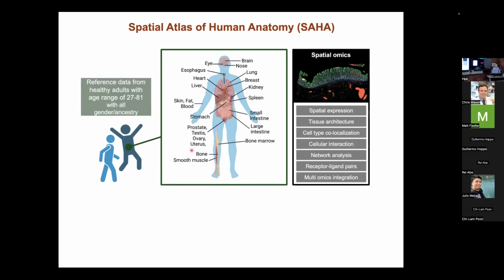Can I ask, what metric do you use to determine heterogeneity, or the extent of the heterogeneity? When you say that, you mean cellular heterogeneity? Yeah, I guess so. I think it's a fair point in the sense that, look, every cell is going to be a little different from each other. I think if you took a root mean of the various expression levels within the cells, they're extending far beyond that.